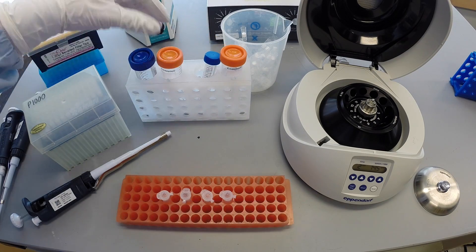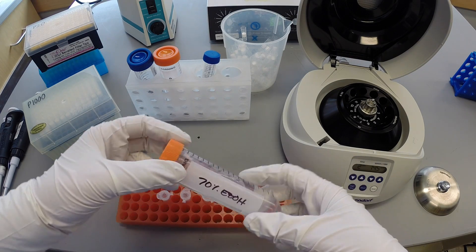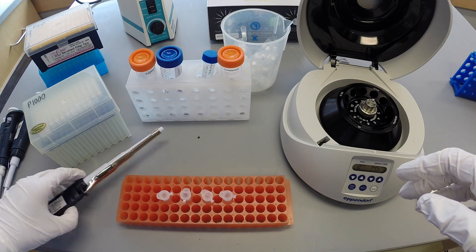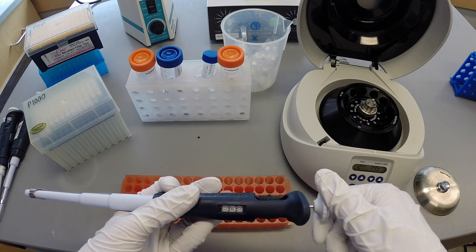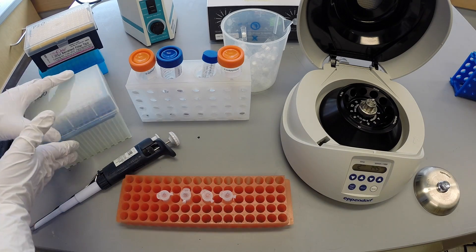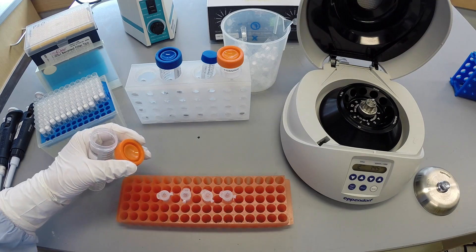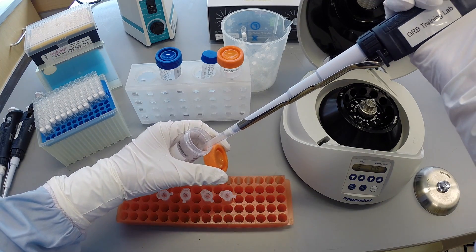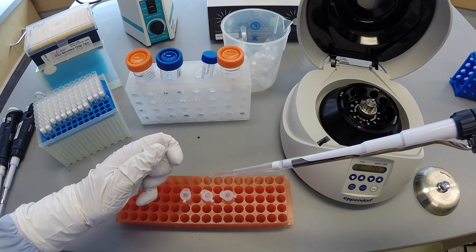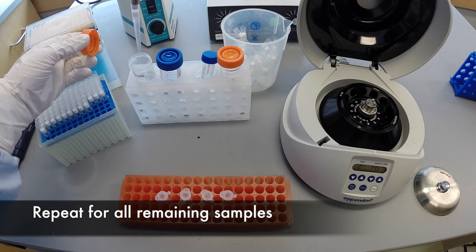Clean the DNA pellet by adding 250 microliters of 70% ethanol to each sample. Do not mix this solution, as it is imperative that the pellet is not disturbed. Repeat this process for all remaining samples.